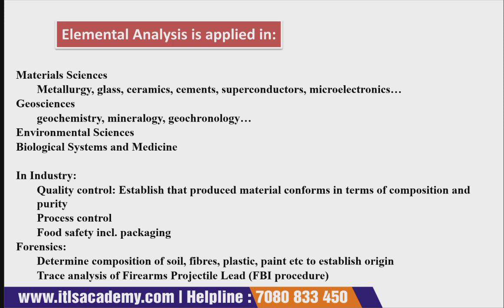It has a huge application in pharmaceutical industries also, as it is used to identify different types of samples, different types of compounds that are used in the production of drugs, or you can simply say it is used in analysis for drug discovery.